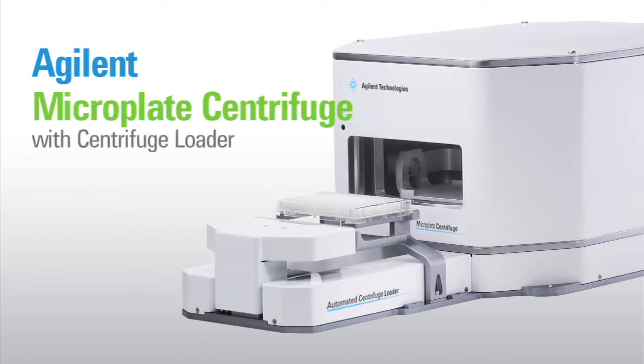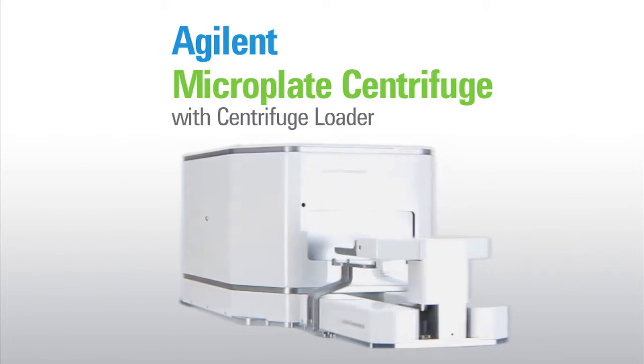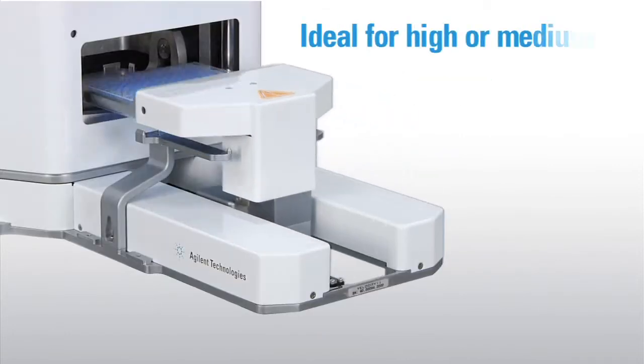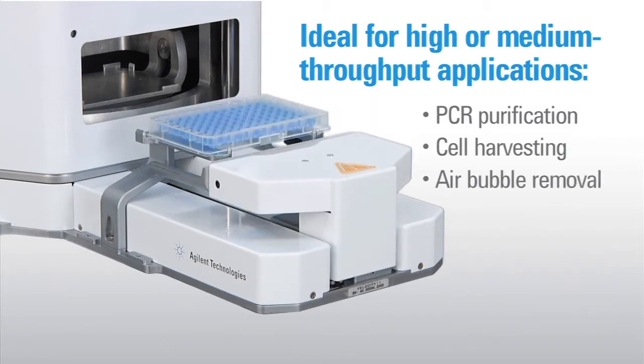The Agilent Microplate Centrifuge is a small, robot-accessible automated centrifuge that provides both vibration and noise control in a small, low-maintenance package. Ideal for high or medium throughput applications such as PCR purification, cell harvesting, and air bubble removal in high-density microplates.